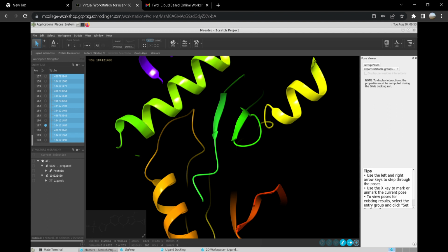Yeah, there is another question which was raised by Mukti. So using Prime MM-GBSA, we can calculate the binding free energy. So here, I think my machine came back. You can see here the project table has the complete scoring. Usually scoring is what is used to rank order the different molecules. But you can subcategorize it and have other parameters also to shortlist the molecules. You don't have to just stick to docking score alone.